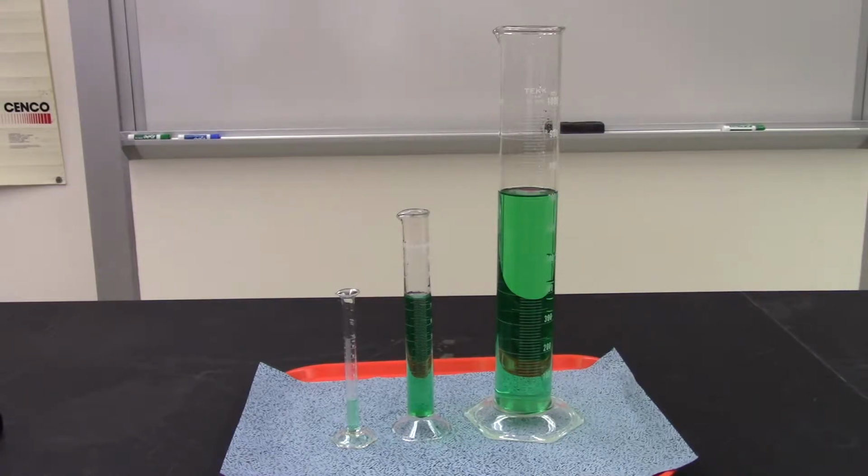Now, again, I am not going to tell you what to put in the table. You're going to have to figure that out for yourself, but I am going to zoom in on the meniscus of the liquid, and I'm also going to zoom in on the sizes of the containers. You're going to have to figure out what goes where. Don't forget to use the units and the appropriate number of significant figures.